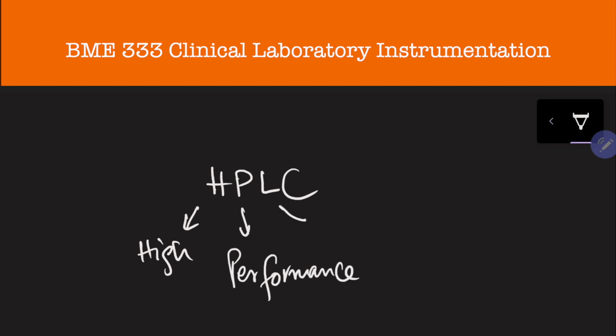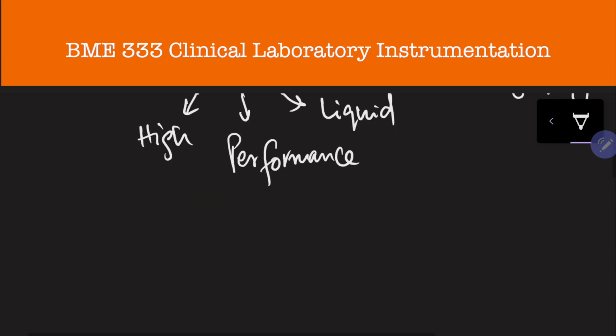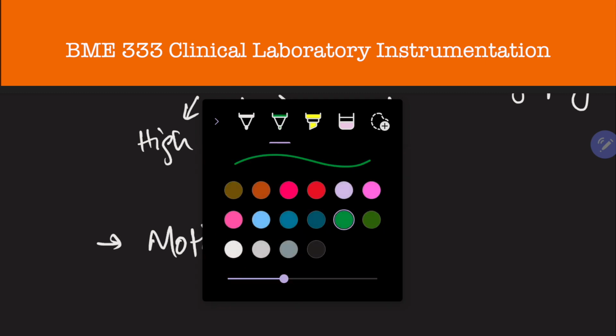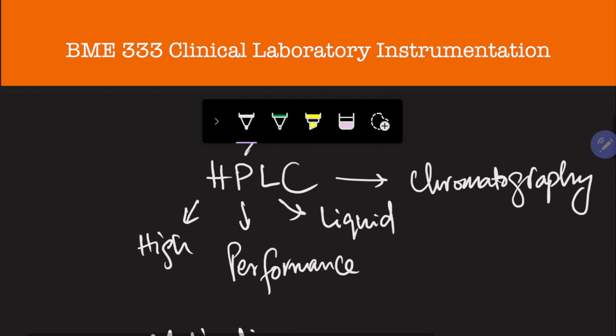We know that chromatography is a separation technique, of course, but one of the major applications for this kind of chemistry is usually testing and analysis of suspected illegal drugs, for example, in body fluids amongst athletes. And then there's always a research aspect to it as well. So basically in forensic science, this is a very important analytical tool.